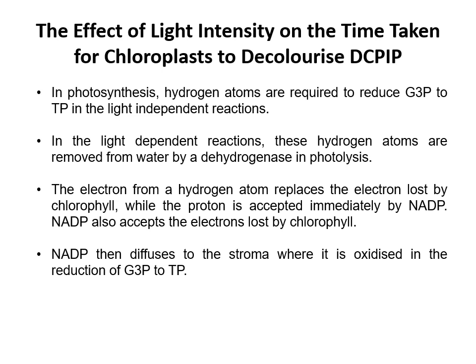In this video, we're going to run through one of the required practicals where we investigate the effect of light intensity on the time taken for chloroplasts, or a suspension of chloroplasts, to decolorize a solution known as DCPIP. So we're going to run through the background science behind this experiment and then hopefully watch together a demonstration of the investigation being carried out. So, things to bear in mind then.